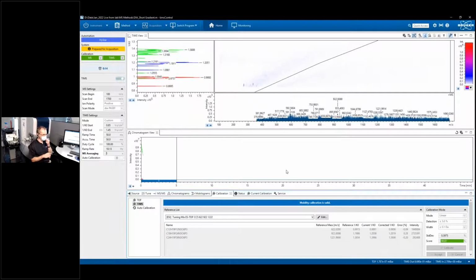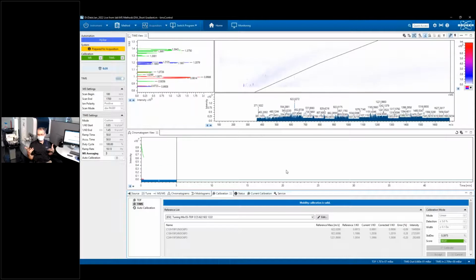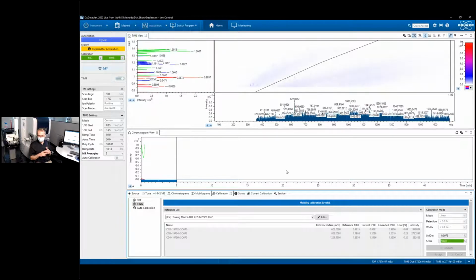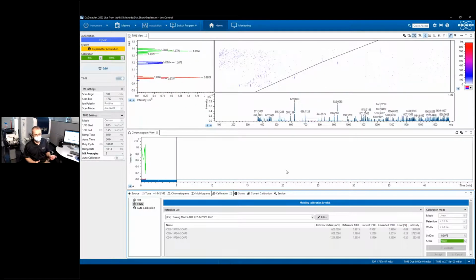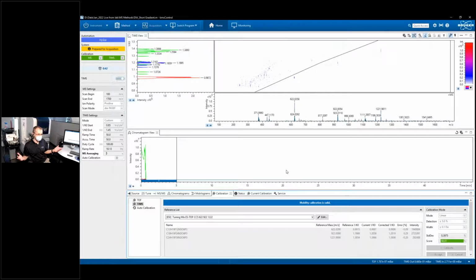Yeah, absolutely. I think we sort of alluded to this a bit. If you have an LC system like the Evosep, you can run these very short gradients. The so-called 200 or 300 samples per day methods allow you to acquire data over just a 5-minute gradient. Of course you can push that out to longer gradients if you want maximum depth of coverage, like in the example with the human and yeast mixed proteome experiment, where we saw over 11,000 quantified proteins from a 100-minute gradient.